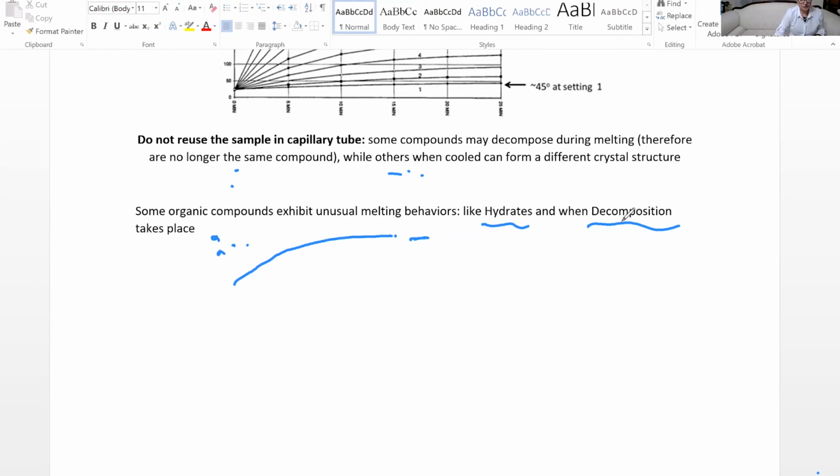When you watch these pre-lab discussions, read the experiment from the lab manual as well, and take the pre-lab quiz. Then you are going to watch the actual video while I'm performing the experiment, and you collect the data and record it on a piece of paper in your lab notebook, so you can use that to write your lab report. This experiment is going to have multiple sections, and you will collect data for multiple parts.